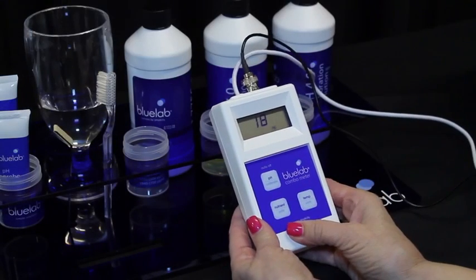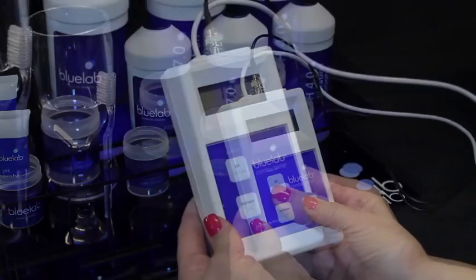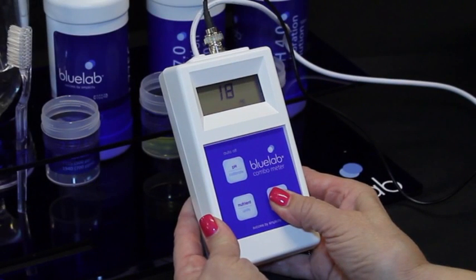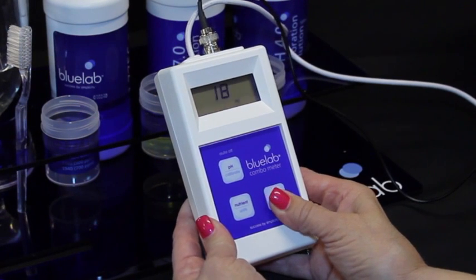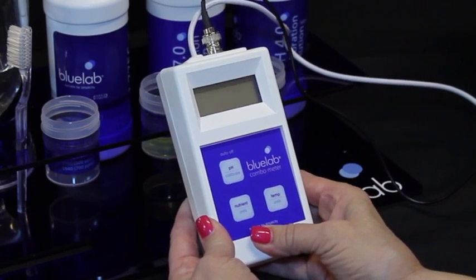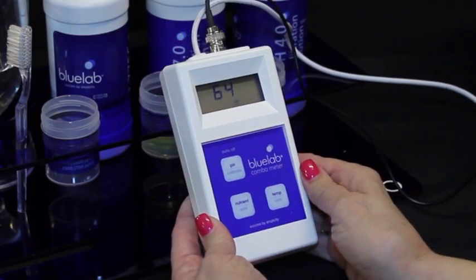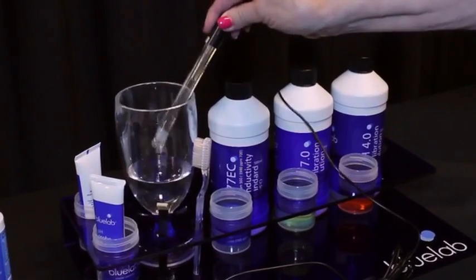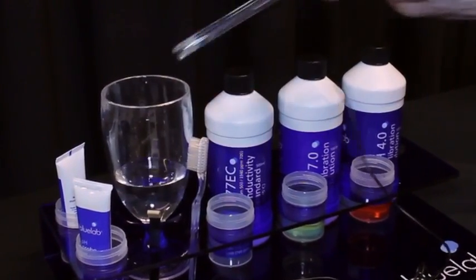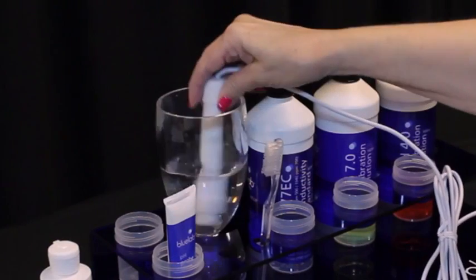To take a temperature reading, press and hold the temp button until the display starts flashing, then short press the same button to scroll through the units and stop pressing when the required unit is displayed. If you're taking measurements from different solutions, always rinse each probe using clean tap water to remove traces of nutrient solution and ensure accurate readings.